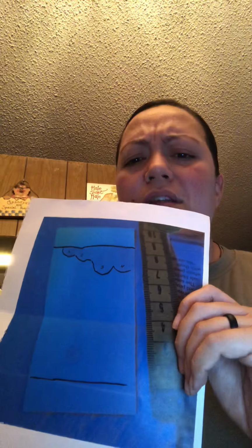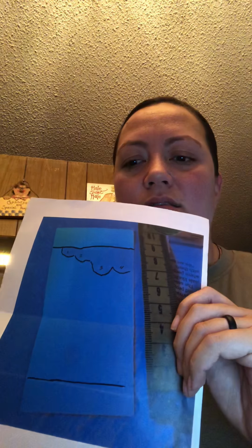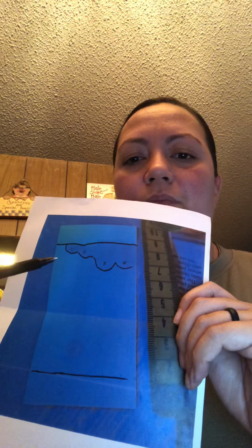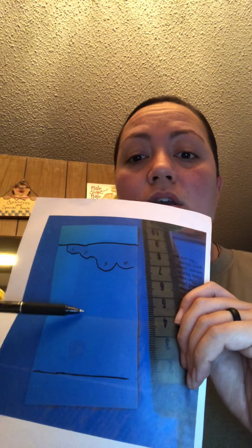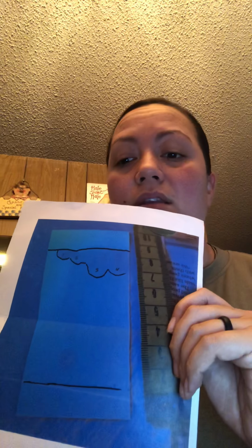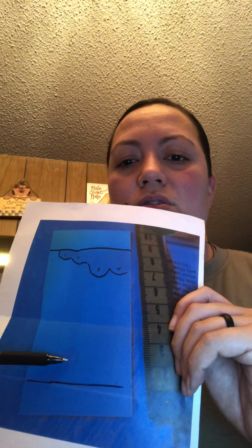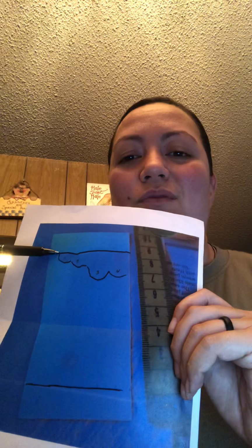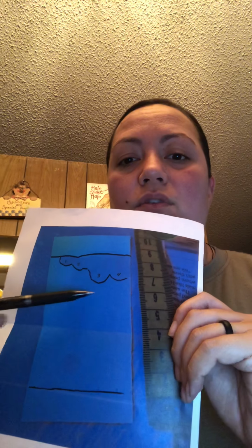I calculated the RF value by using the distance moved by the pigment over the distance between the pigment origin and the solvent front. So the first number is from the center of the origin spot all the way up to the pigment, and that would be divided by the distance from the origin all the way up to the solvent front, the solvent line. That becomes the RF value. So 1 and 2 are similar, 3 and 4 are similar.